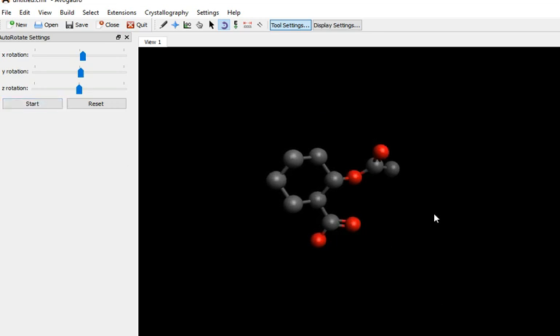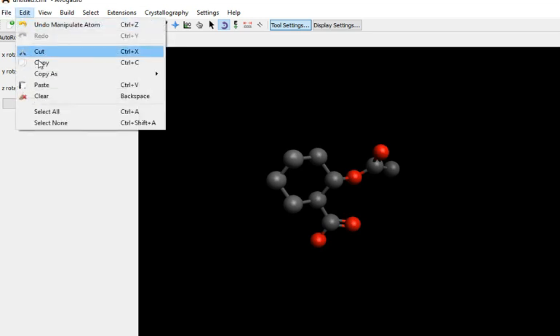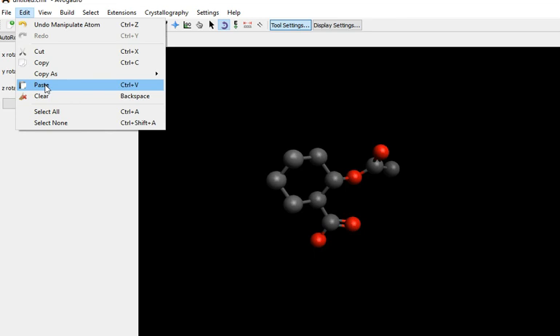You might want to make a copy of this, if you were to start modifying the structure, and save the original temporarily. It's very easy. Edit, copy, and file it, paste it in a new page. Very easy to do.